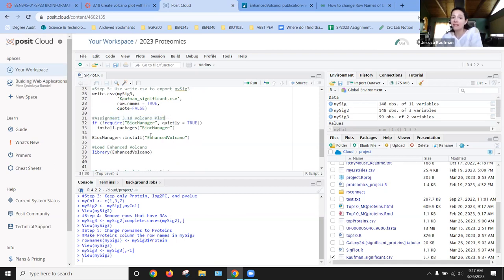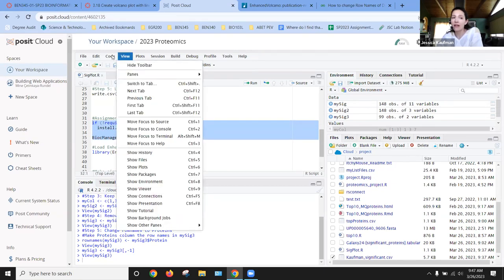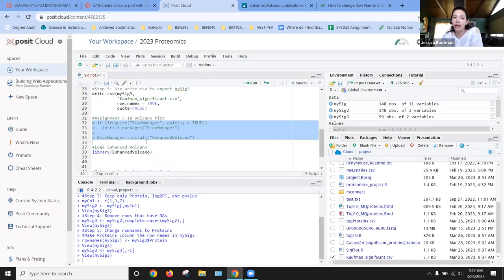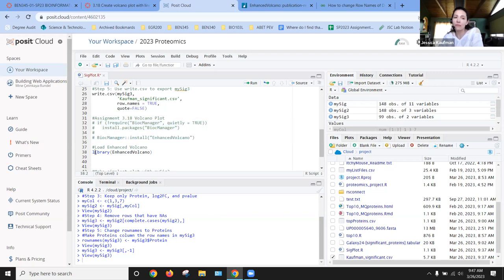I need to install the enhanced volcano tool, and once I install it, I want to comment it out because it uses a lot of memory to install tools over and over again. Every time I open up my workspace, I am going to load the library.